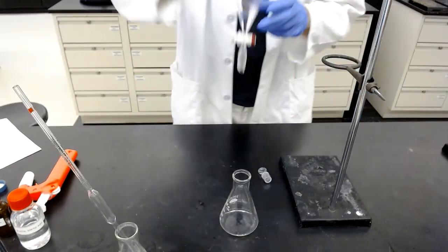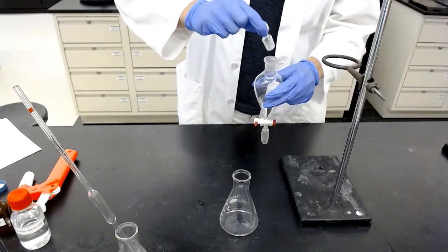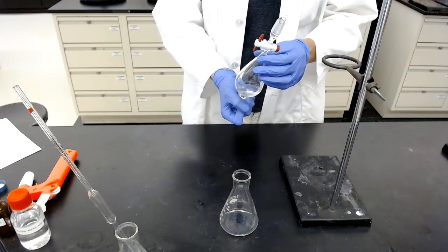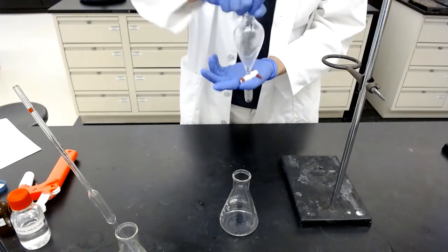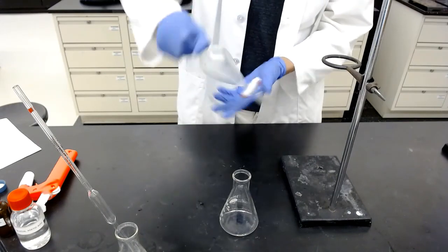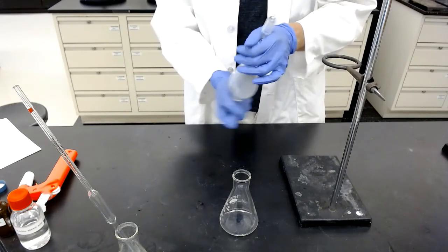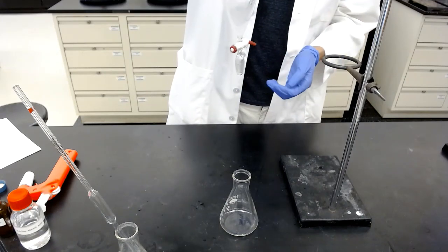And then I'm going to do a typical extraction. So for the stopper on top, I twist it a little bit, make sure it's sealed, flip it over, vent. You hear the sound, right? Yeah. When you're mixing two different liquids together, typically there's a pressure. Then shake, vent, shake, vent. Do that a couple of times, or roughly 3 times is good enough. All right, swirl a little bit.